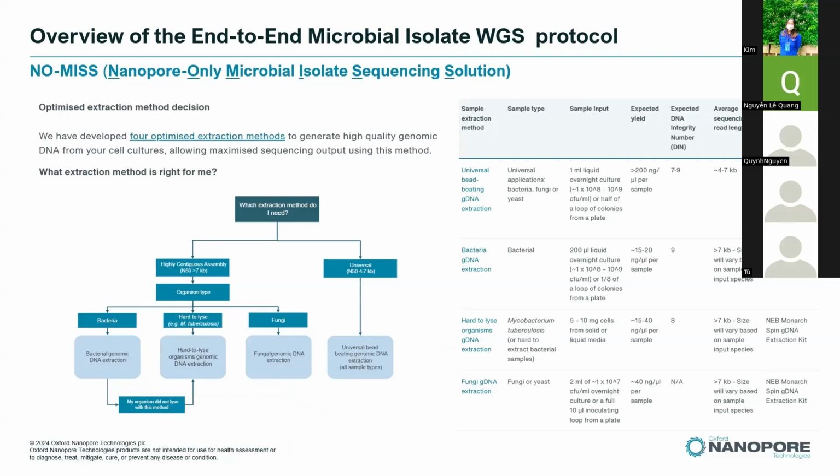And on the right hand side, you can see that we have listed the extraction kits that we used to optimize the protocol, as well as the sample input requirement, the expected yield, and the expected DNA integrity number.